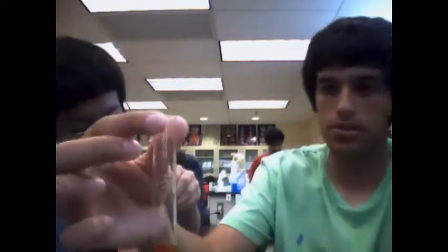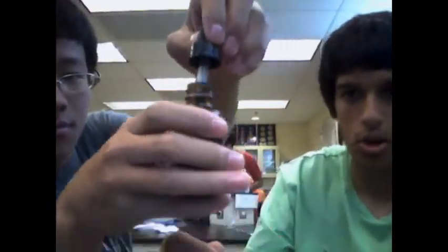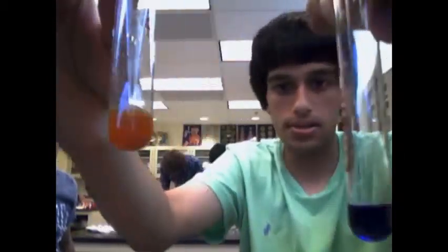Here we have unknown substance number 1, 20 milliliters with 10 drops of Biuret reagent. Notice the color? That's Biuret reagent in the background Professor Philip is holding. That's the color of the reagent. Notice how this is not the same color as the egg albumin. Because we know this contains proteins, and the colors are different, we know that this unknown substance 1 does not contain proteins. The Biuret reagent reacts with proteins.